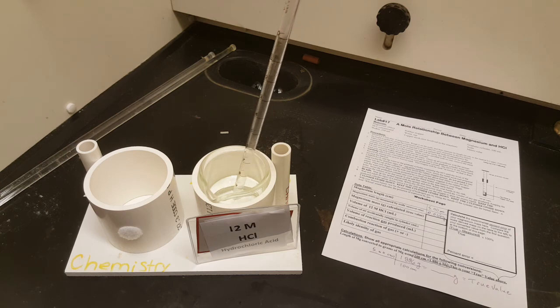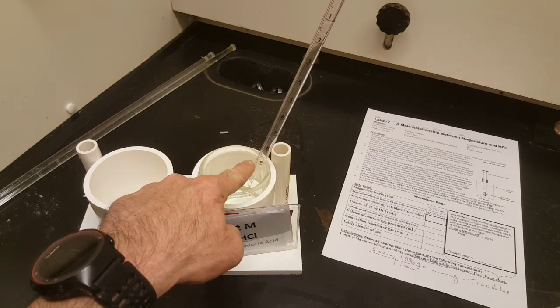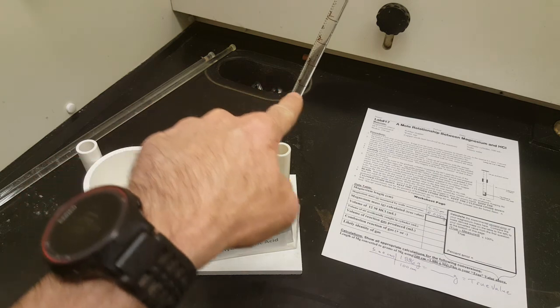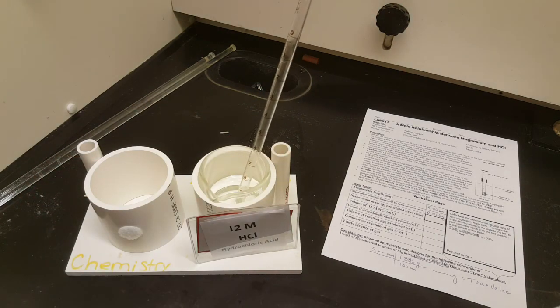We want you guys to retrieve 6 milliliters of concentrated hydrochloric acid. And you'll notice that the pipette numbers go backwards. So 6 milliliters, 1, 2, 3, 4, 5, 6, is actually the number 4 on the pipette.